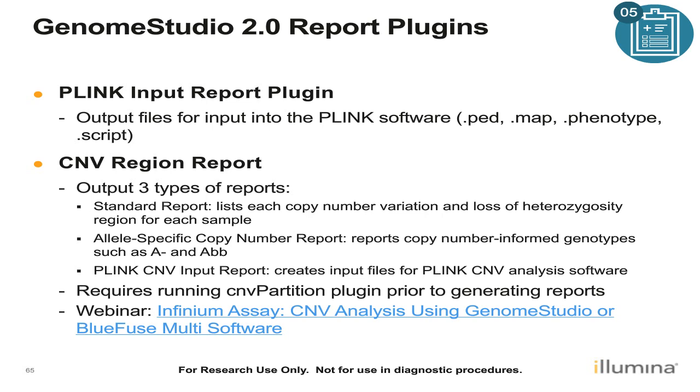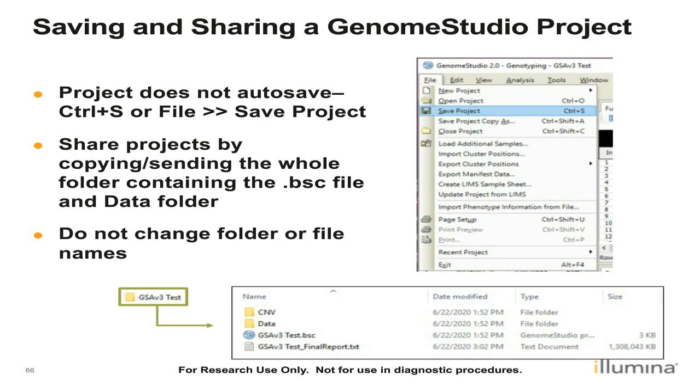One final note: after you've exported your report and you're happy with your data, it's important to make sure that you're saving your GenomeStudio project because the project does not autosave. To save, you can click Control-S or you can go to File and Save Project.